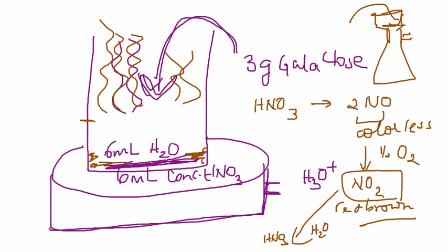Wash it with 3 10 milliliter portions of ice water and allow the product to air dry. And as you filter through and you air dry your product, we are actually going to also start the oven. So if need be, you can also dry this in the oven. The melting point is so high that we'll be okay at 100 degrees.